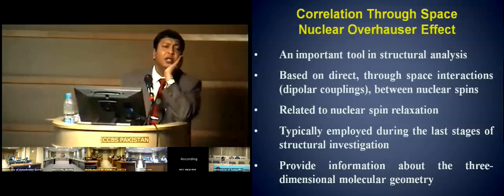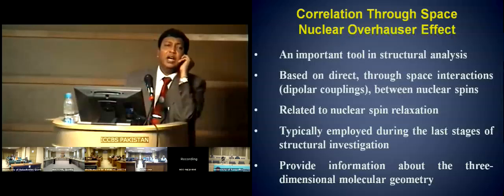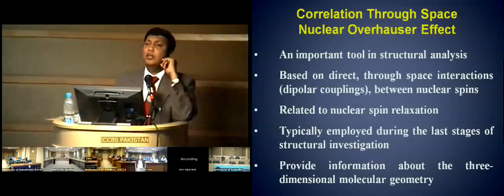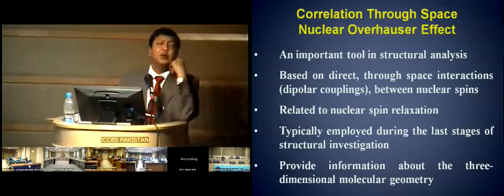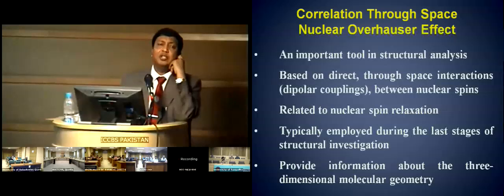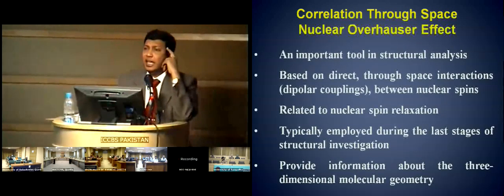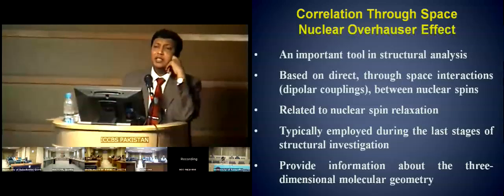We learned that also. We also learned that when you do that, you lost a very important piece of information, and that is the multiplicity. So we learned that there are techniques like attached proton test or gated spin echo, Fourier transformation, GASPE, etc., through which you can determine the multiplicities.